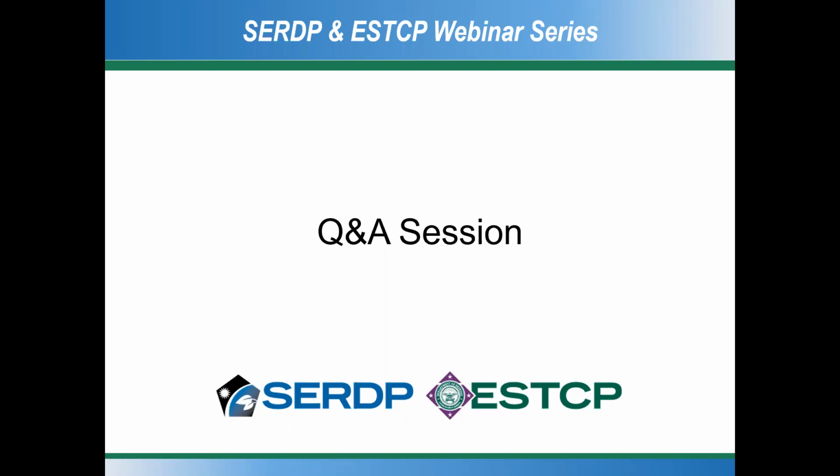There's lots of interest in that, Reiner. Sure. So I assume the question is on the nanographene. Unfortunately, it's a one-time deal because in the process of the extraction, we destroy it. So that's an easy one.